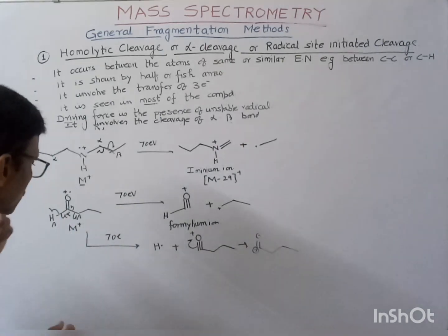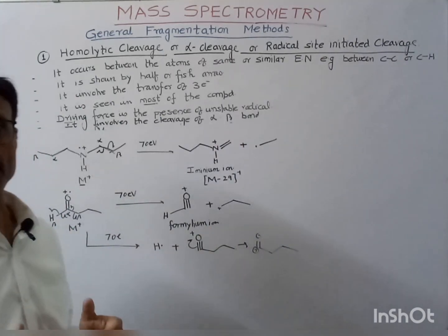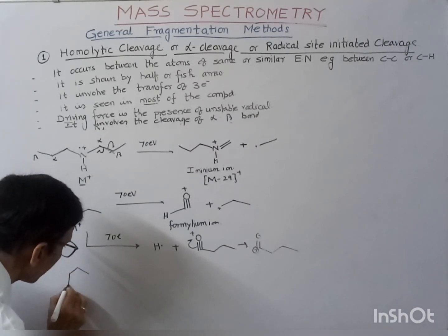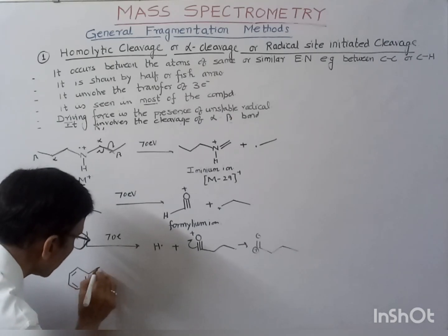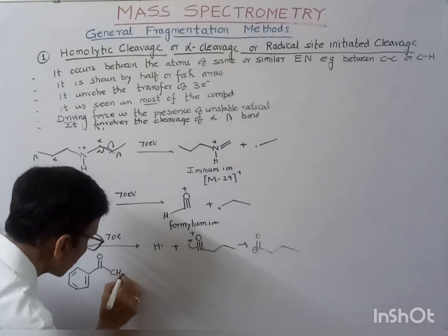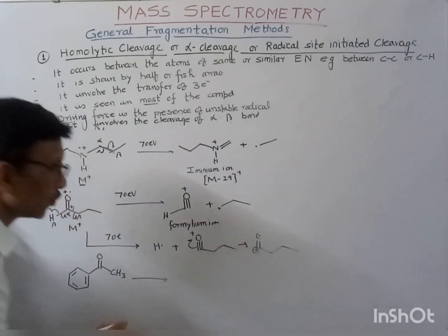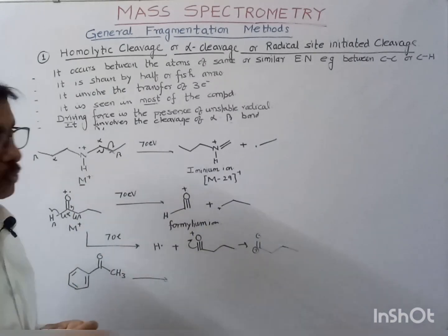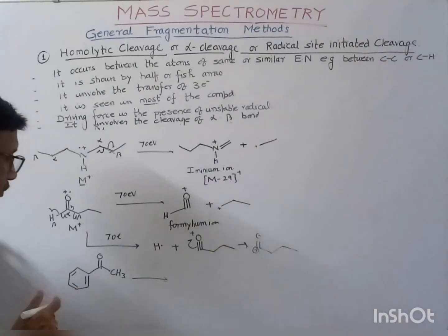In the same way, suppose we have some aromatic compound, an aromatic ketone. This aromatic ketone will undergo cleavage.